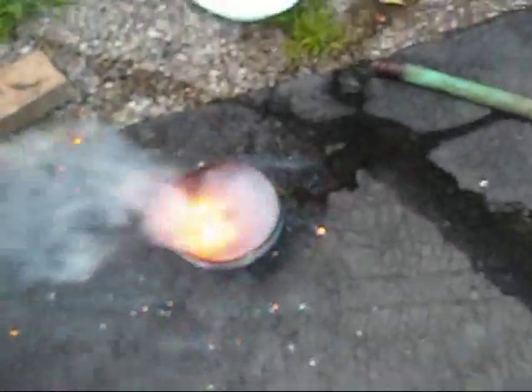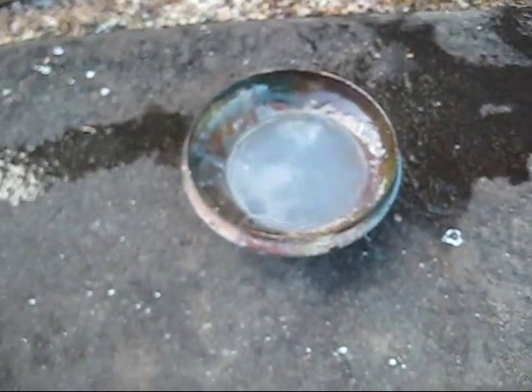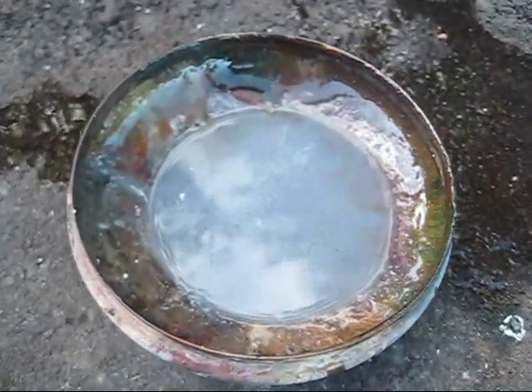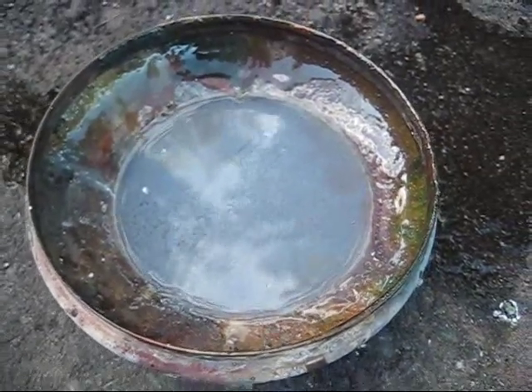That was bright. Real bright. Well, there you go — watch me get splattered by molten sodium, so I hope that was fun for you.